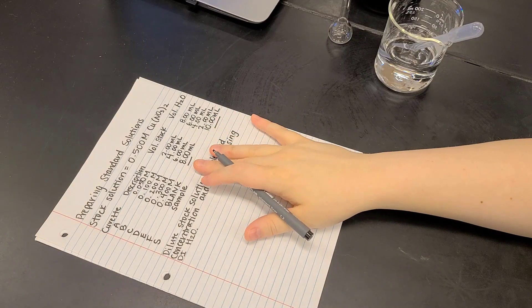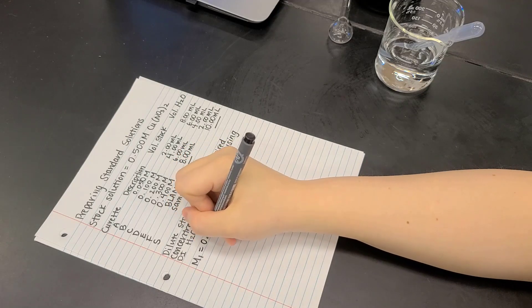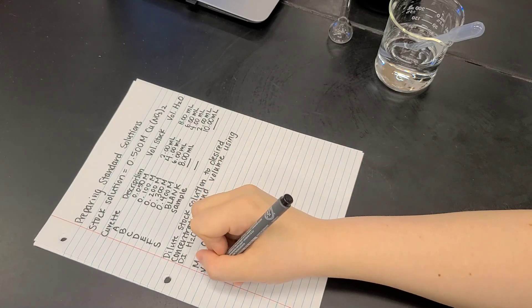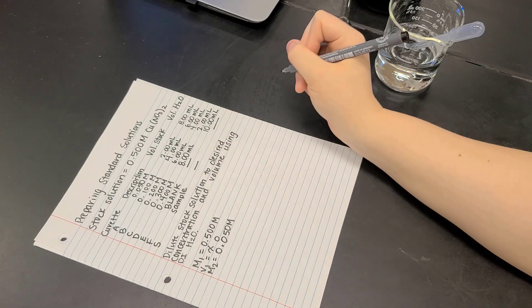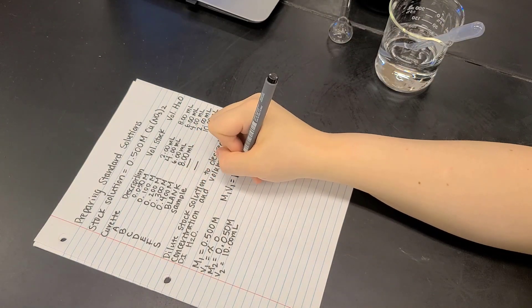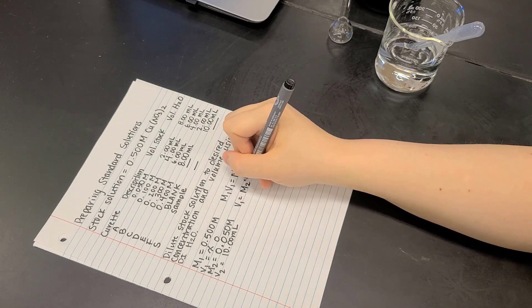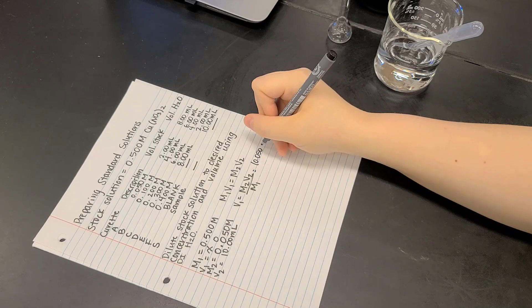Now we're going to prepare our standard copper²⁺ solutions. We have a stock solution that is 0.500 M copper nitrate, and I'm going to dilute that to make several solutions labeled A through E with concentrations of 0.05, 0.1, 0.2, 0.3, and 0.4 molar — 10 milliliters of each. I'm using M₁V₁ = M₂V₂ to calculate the volume of stock solution needed, then combining that with the appropriate volume of water.